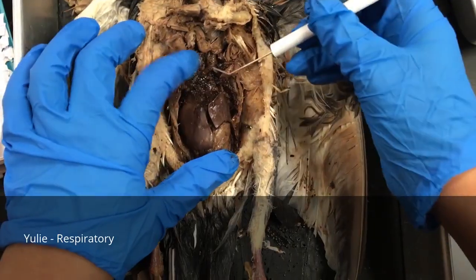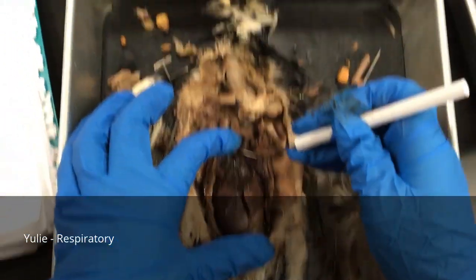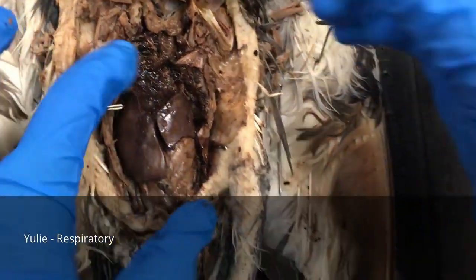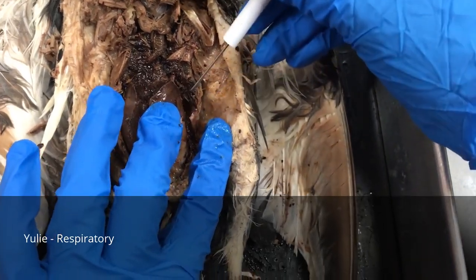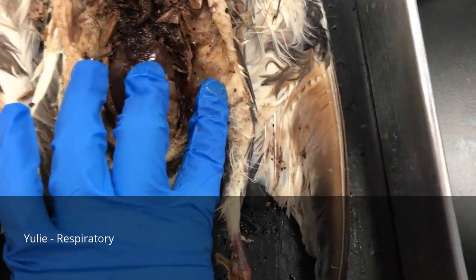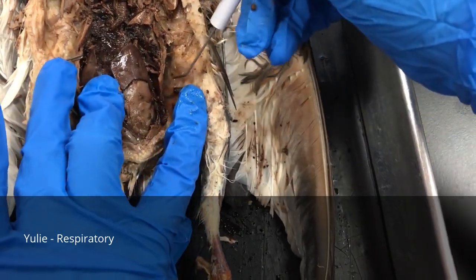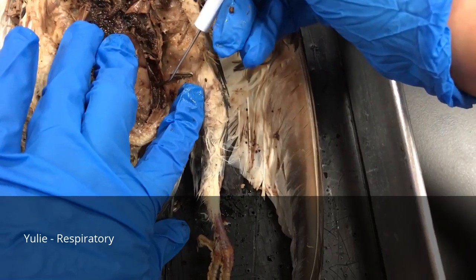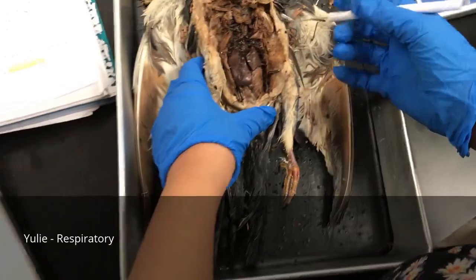Right here you can see the trachea. It comes up from the nose and down to here, into the trachea and into the lungs. Right here, it's kind of hard to see, but there's a lung right here, and on the other side we have another one. Right here is a remnant of an air sac. It's kind of hard to see because most of it is membranous, so when it's preserved, it tends to not preserve really well. And then we might have another air sac down here, and that's the respiratory system.